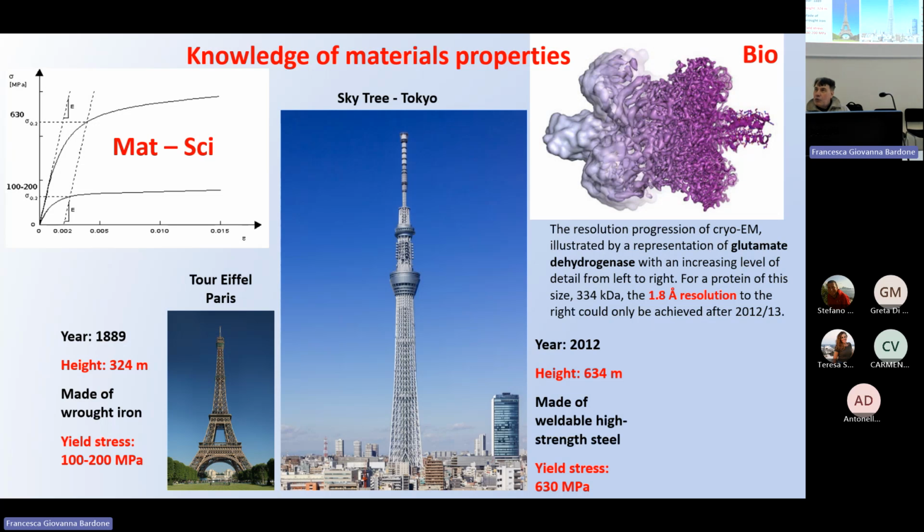With very high resolution, you can detect the atom position down to 1 angstrom. You can see how atoms are arranged with this type of specific preparation. If you don't have resolution, you can have the shape of your object, like the left part of your molecule, but you don't see where the single atoms are.